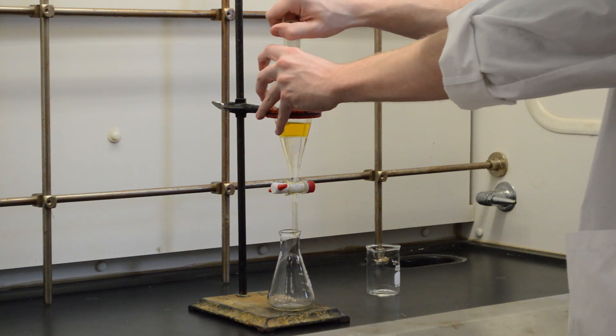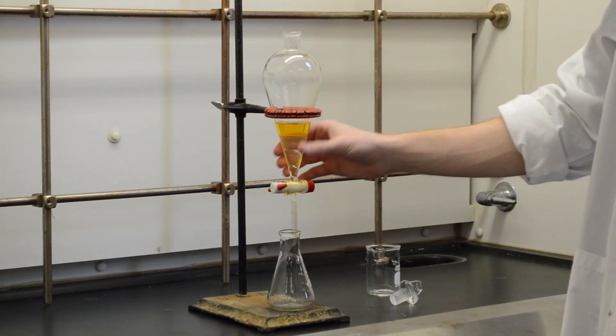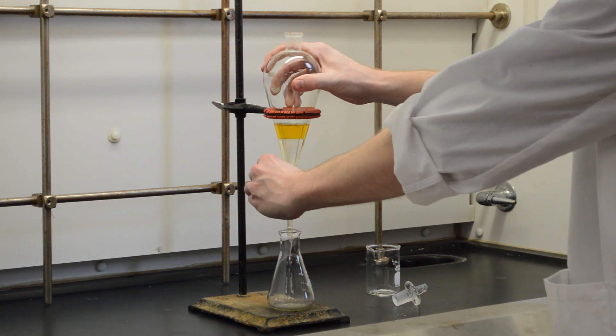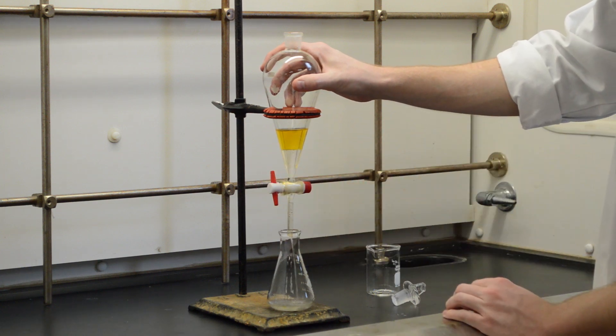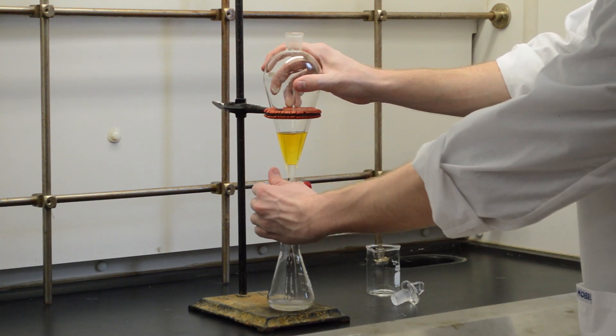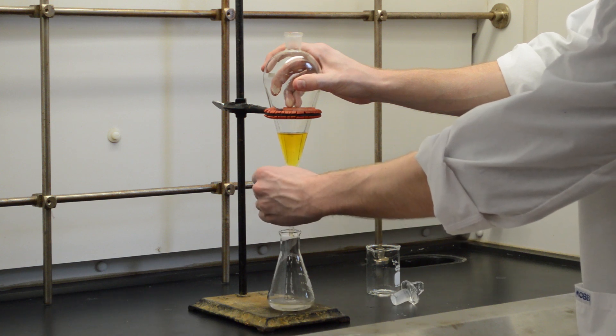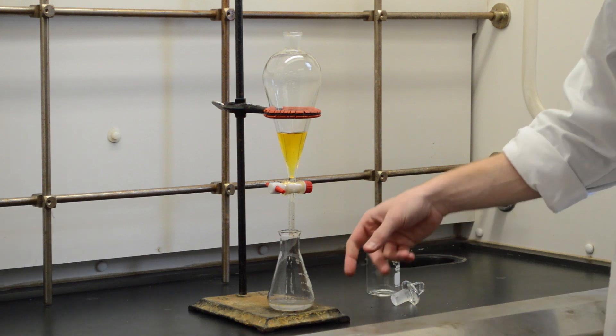Before you start to pour, you want to make sure that your stopper is out so that it will actually come through. Then you can just open this up and that bottom layer will pour right through. You want to be careful that you don't get the water layer as well as the DCM layer. Once that gets pretty close, you can cut it off since you know the product you want is in the bottom.